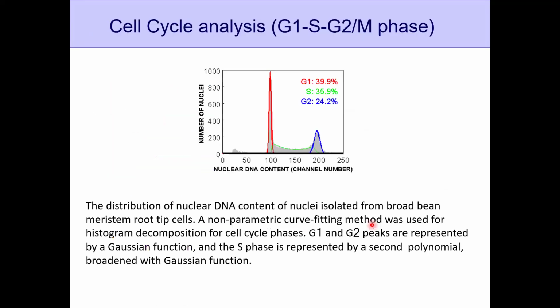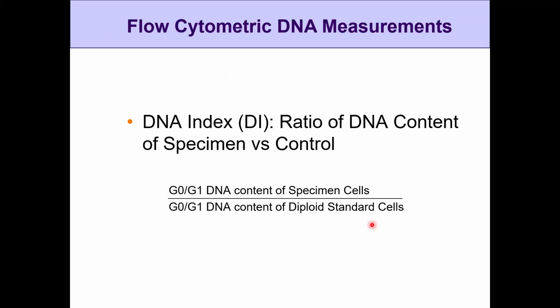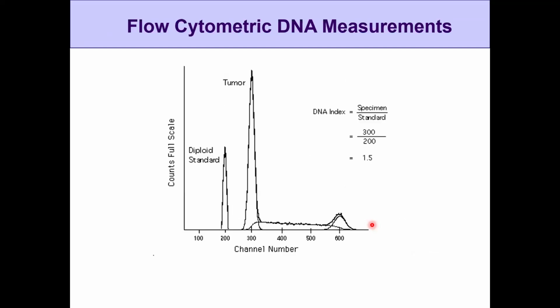Now in plant biology, it is very helpful. We use it for ploidies, because plants have multiple ploidies. Like we humans have few ploidies, but plants go for multiple ploidy, triploidy, quadruploidy. And to get a proper crop, we need all these ploidies. So you can count the ploidies using flow cytometers.